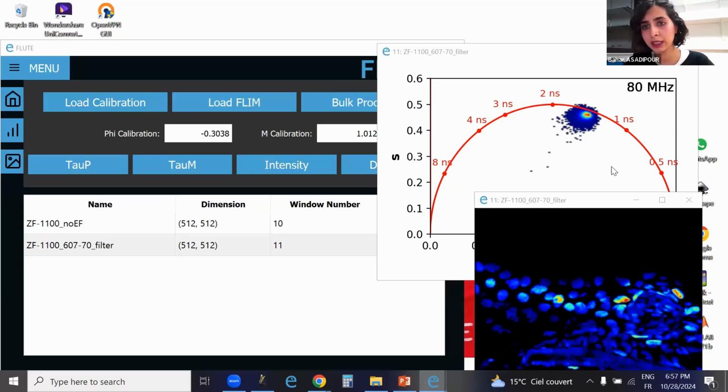If you want to do that in the average area that you are interested in, or in every pixel, what you do is that you divide your distance over that value to get something that is normalized and can give you the fraction of bound. I don't know if that answers your question.